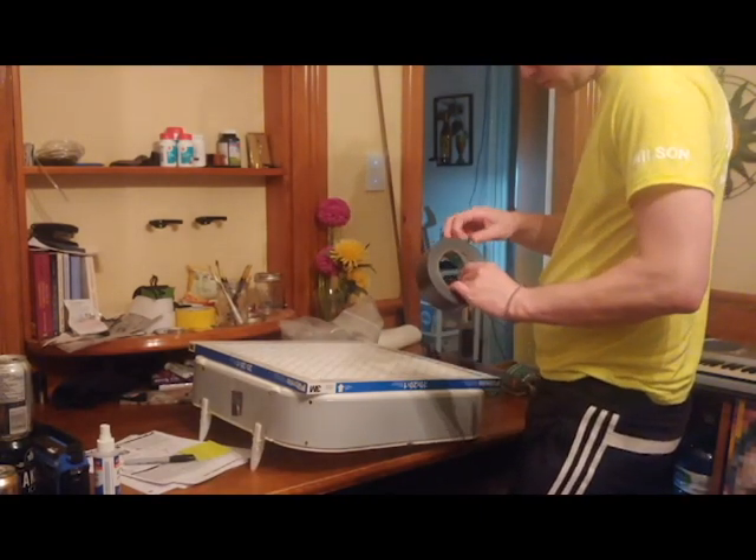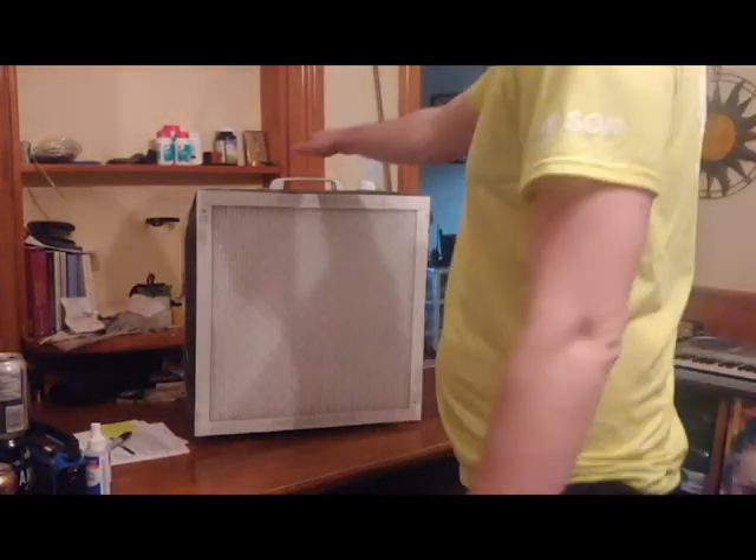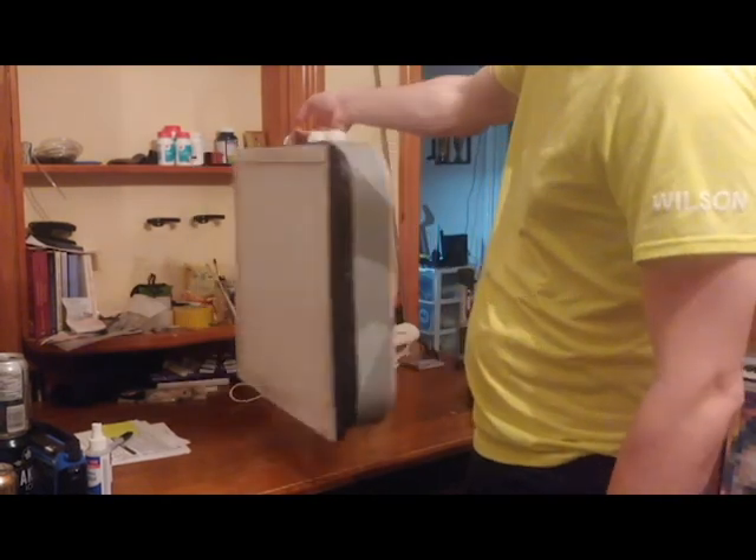For the rest of the video I'm going to be showing how the box fan works and if it works, and I'm going to be doing that with agar work in the following clip.